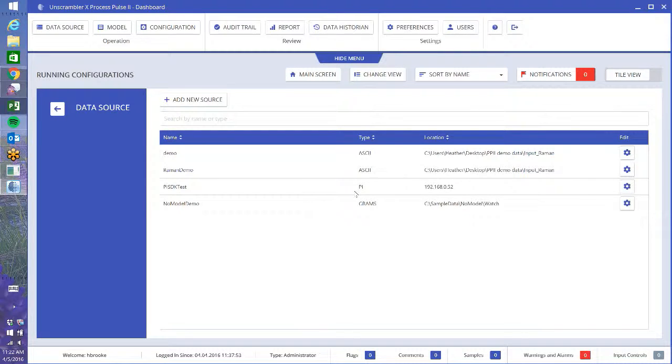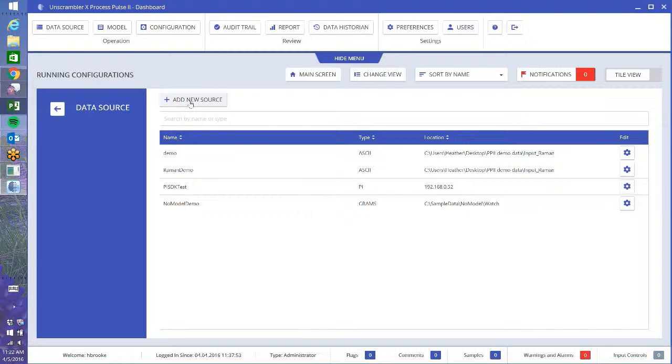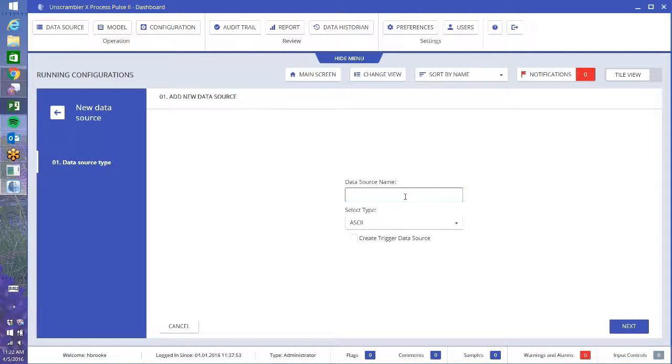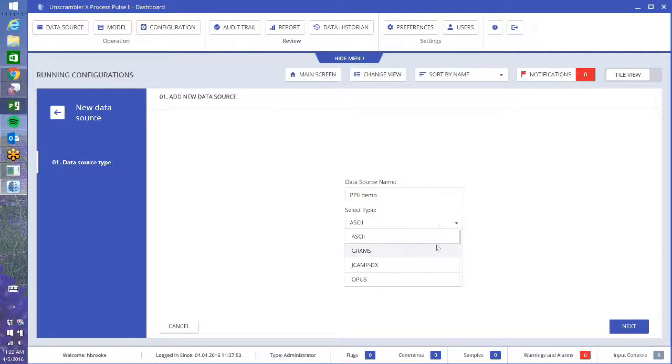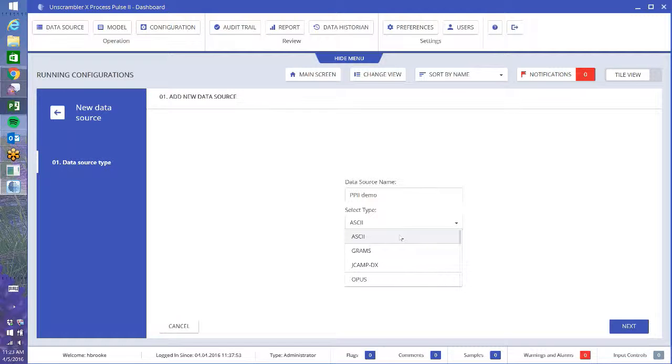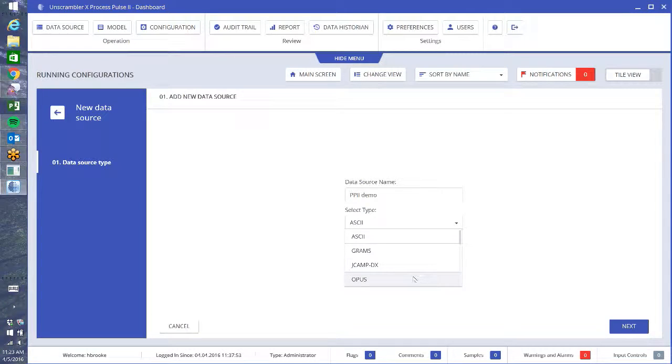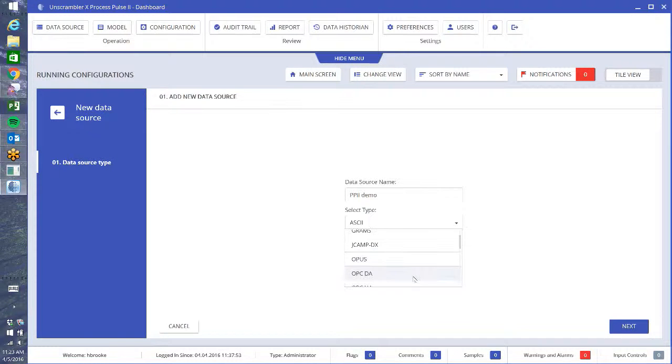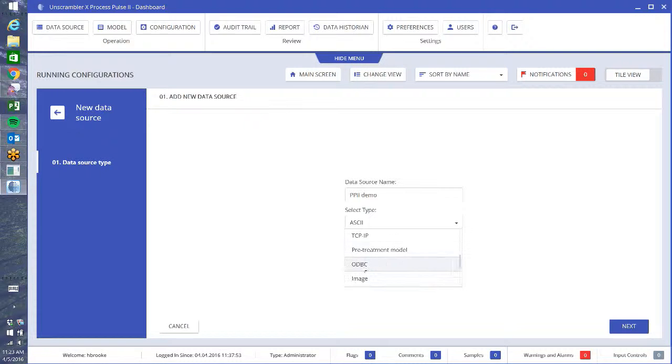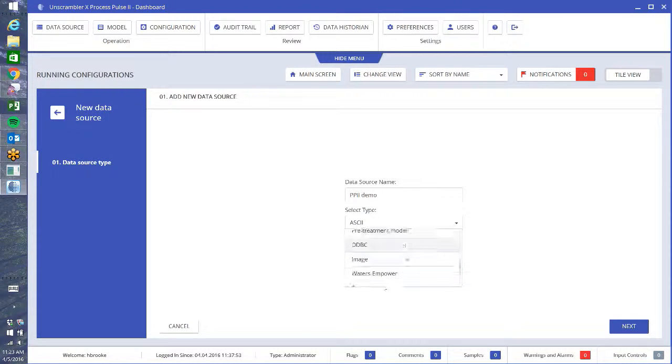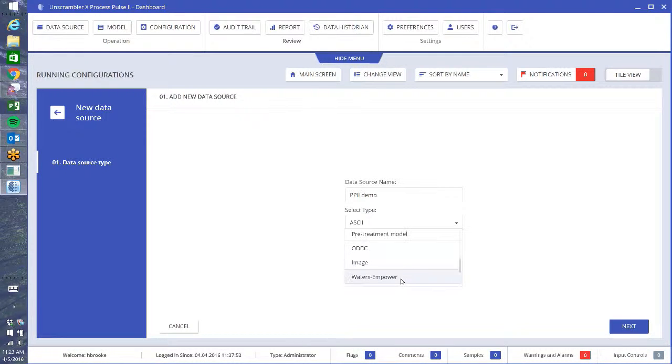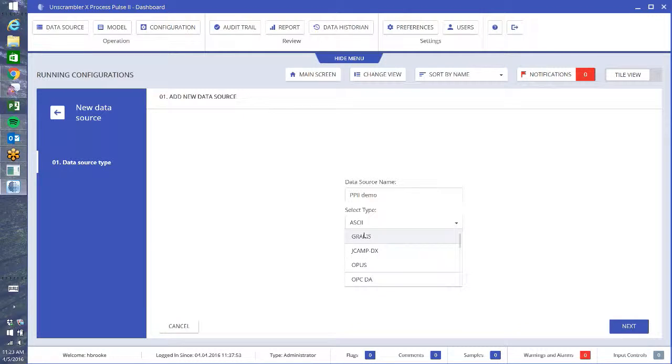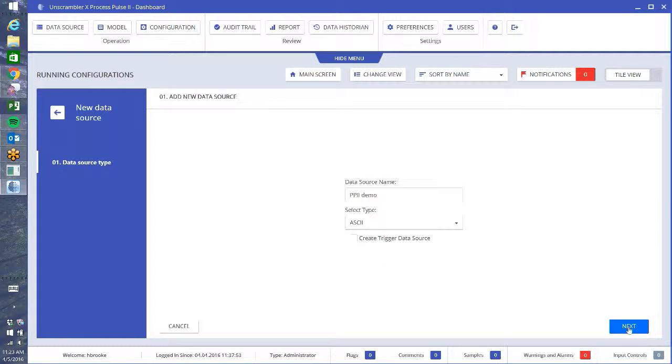If you wanted to come in here and you have one that you've already made, you can always edit it and change some of the settings if you need to. So what we're going to do is add new data source. I'm just going to give it a name, Process Pulse 2 Demo. Then we select our type of data. We have all types of data: ASCII, that's going to be your CSV and text files. We have a number of different proprietary spectroscopy formats, PI, TCP-IP, all kinds of fun things in here that you can use. I'm just going to stick with the ASCII for now and I just press next.